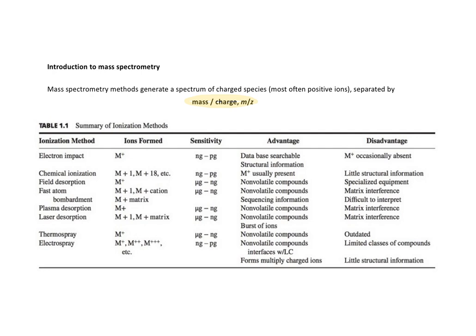A notable aspect of mass spectrometry is the exquisite sensitivity. In many cases, only nanograms, even picograms of material are sufficient to get quality information. As a result, mass spectrometry is now an essential tool in characterizing biomolecules in a biological matrix, such as blood or plasma.